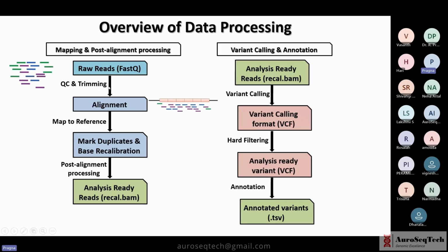The reads are trimmed, and if there is any adapter contamination, or if the base quality is not good, that kind of read, or the part of the read, is deleted. Let's assume we have a clean read. Now the reads have to be aligned to a reference genome. I will talk about the reference genome in detail tomorrow.